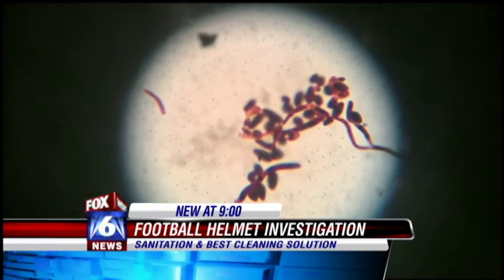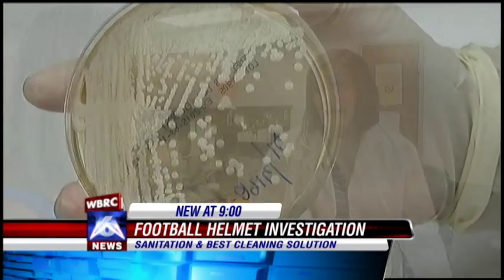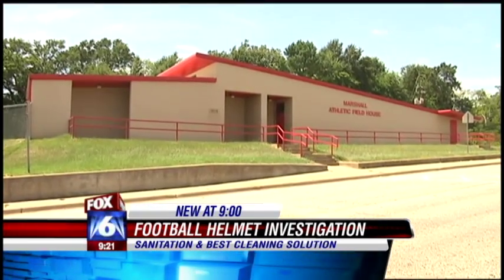Actually, I was most surprised that they weren't that dirty. The one that had the most bacterial growth was the top of the head and the ear. I was expecting maybe to find a little bit more bacteria on them than we did. So despite their smell, nothing too bad was found since they were stored in non-climate controlled field houses.